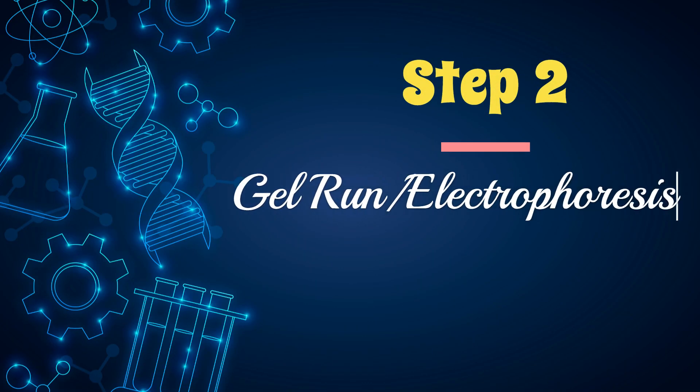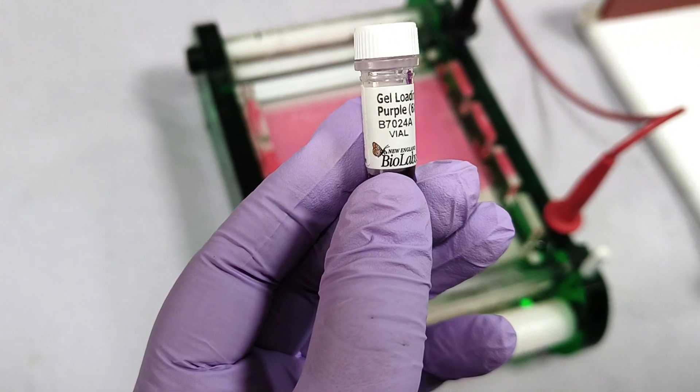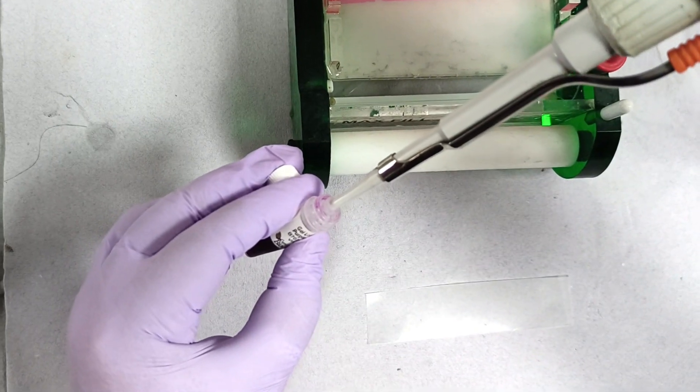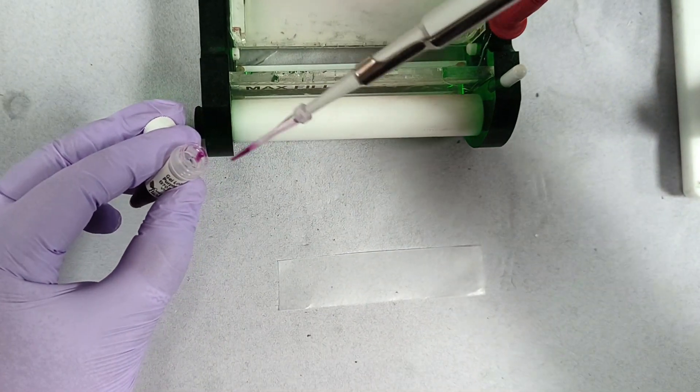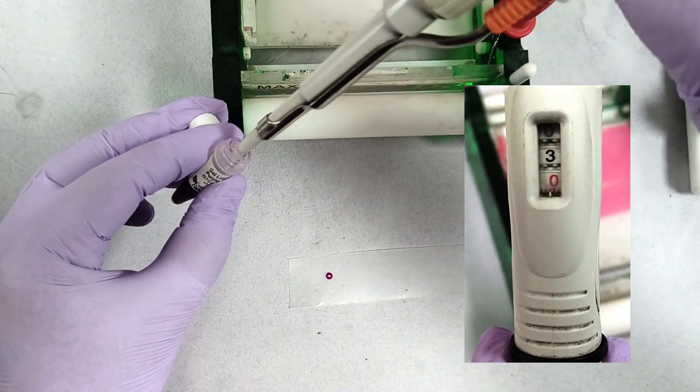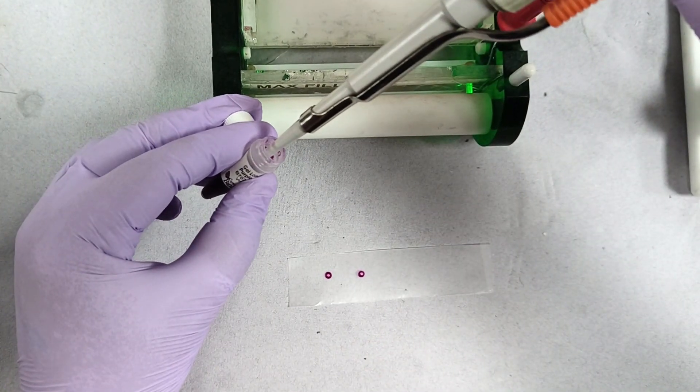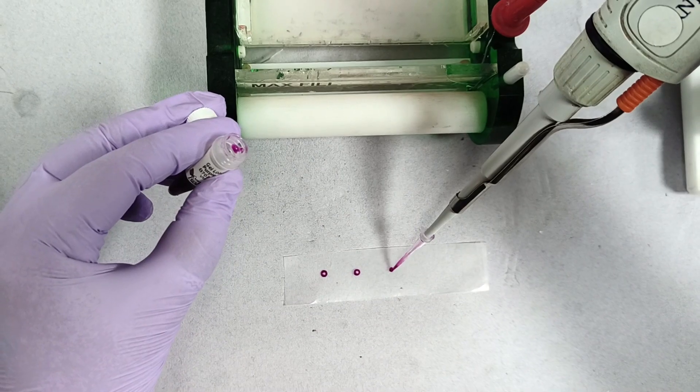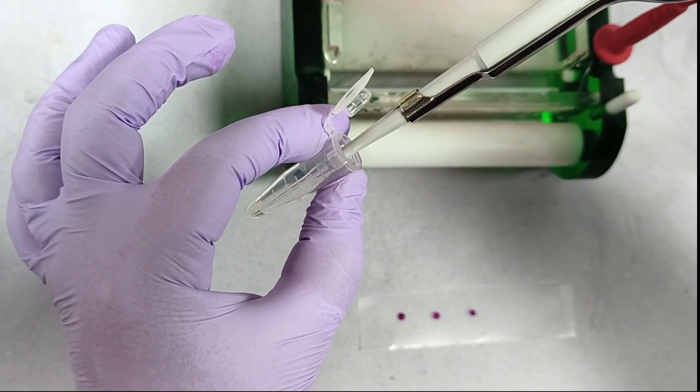Now let's proceed with gel run or electrophoresis. Before loading, mix loading dye to the samples. Loading dye provides density to the samples so that they sink in the well and do not come out. Place a parafilm, dispense 3 microliters of loading dye and then add the samples to it while mixing properly.